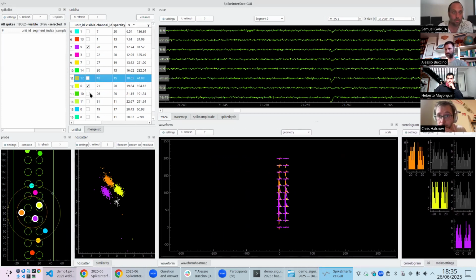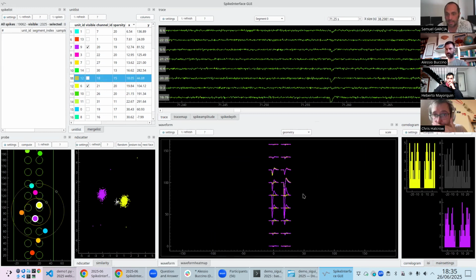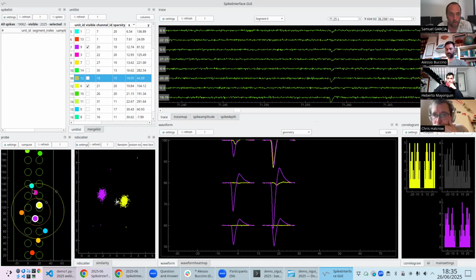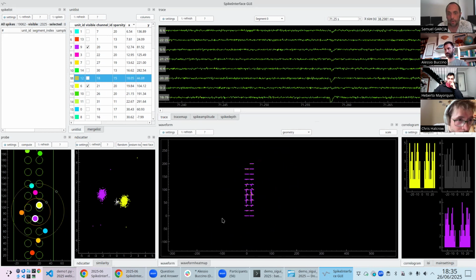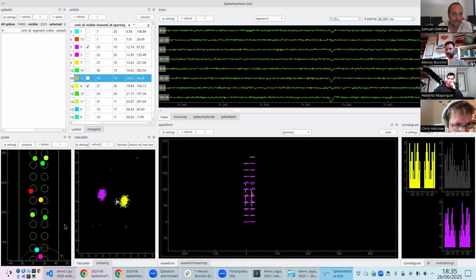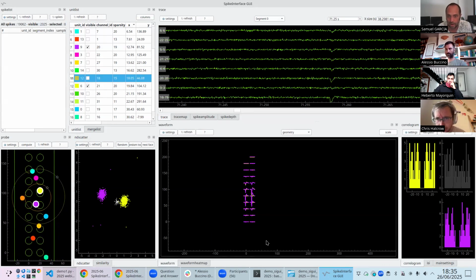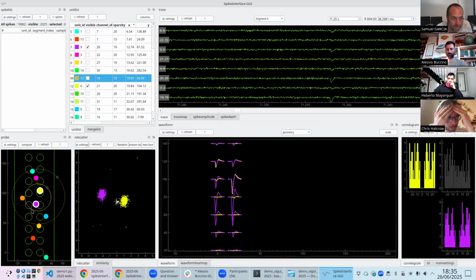So in short, when you want to check if 2 units are different, you want to check: are these 2 units different? So here you have the per channel view. For every unit, we don't extract the template on all the channels. We do it for some channels around, which is known as the sparsity on the SpikeInterface side. So you have a sparsity. And here what we plot is the 2 nearby units, and we plot the channels.